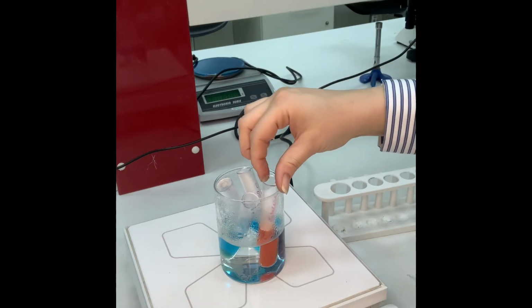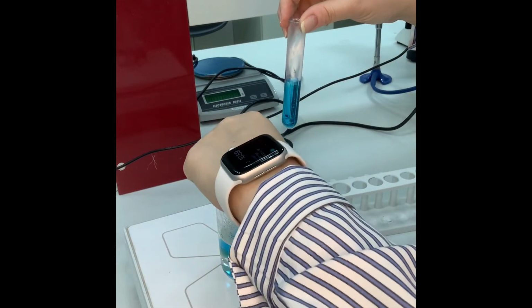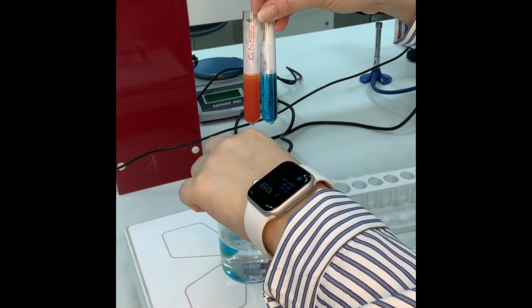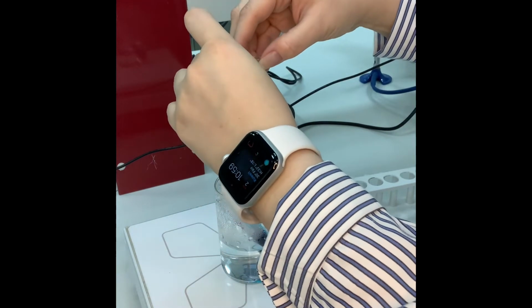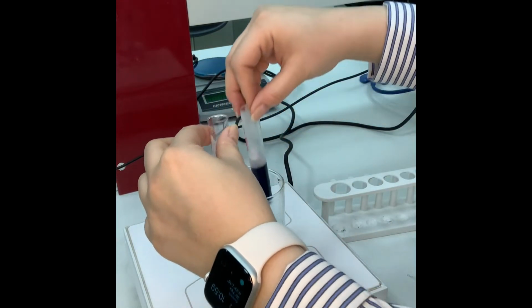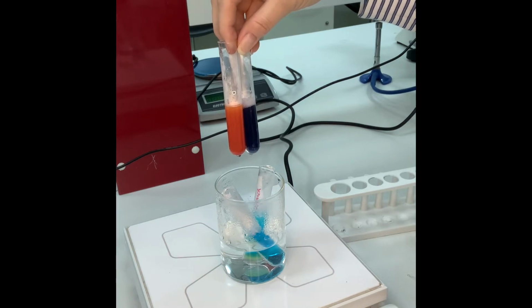But also I need you to look at the negative control. Usually we keep them together to compare our result. Look at the starch, nothing happened. And if you look at egg white, also this is not the aimed color we're looking for. We're looking for brick red, and it will precipitate after 1 hour.